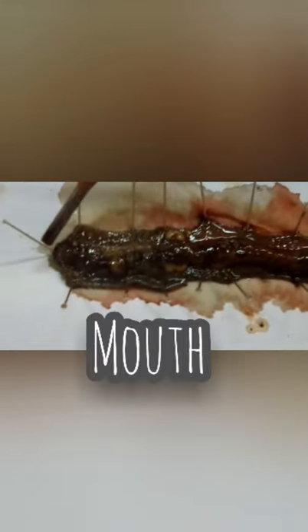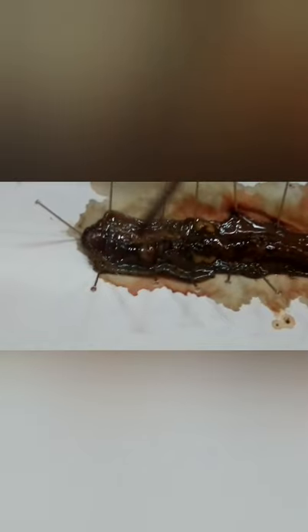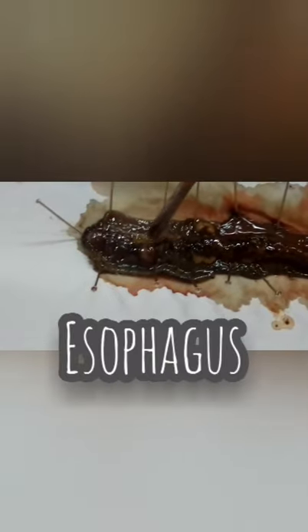At this moment, we're going to enumerate the body organs or the internal organs of the earthworm in the anterior aspect, where the part here at the tip of the anterior is the mouth, while this one is the brain. The part here is the pharynx, and below this is the esophagus.